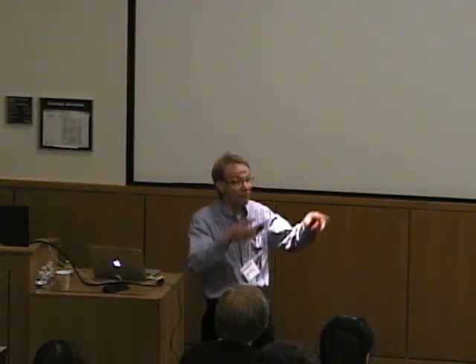Okay? But the caveat here is that you have to make sure that the free energy and the enthalpy are both measured under the same conditions. You know, if your binding constant is determined under different conditions, you can't compare it to an enthalpy measured under different conditions. So that's just one caveat. More advanced things are determining the change in heat capacity of binding, and effects of other perturbants. This gets into the detail of the biophysics of things and is less of a concern to us. And eventually, maybe in 2 years, we'll come back and talk about using ITC to measure kinetics. Okay, but that's not pertinent today.